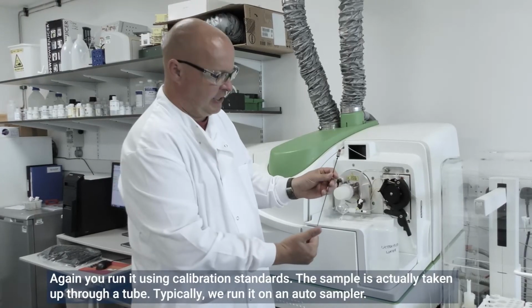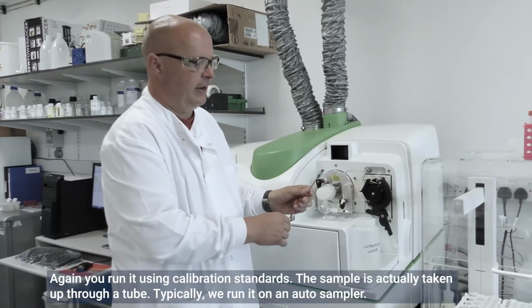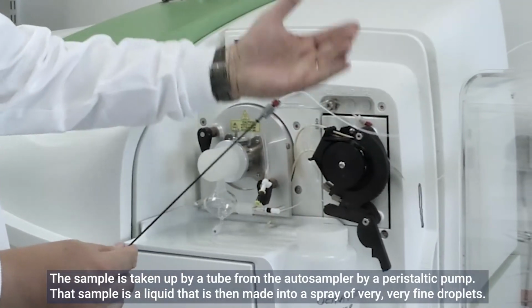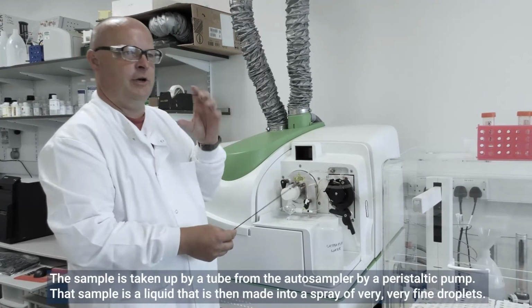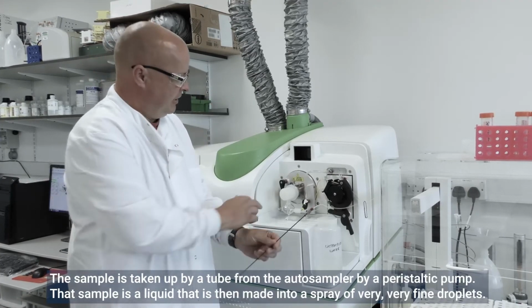Sample is taken up through a tube. Typically we run it on an auto sampler, but all the samples are taken up by a tube through a peristaltic pump, which all that does is draw the sample up. That sample is a liquid. It has to be made into a spray of very, very fine droplets.